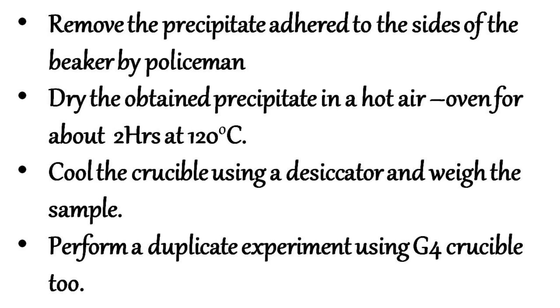Any precipitate adhered to the sides of the beaker should be removed using a policeman. Dry the obtained precipitate in a hot air oven for about 2 hours at 120 degrees centigrade. Cool the crucible using a desiccator and weigh the sample. Repeat the process of drying and weighing till a constant weight is obtained.